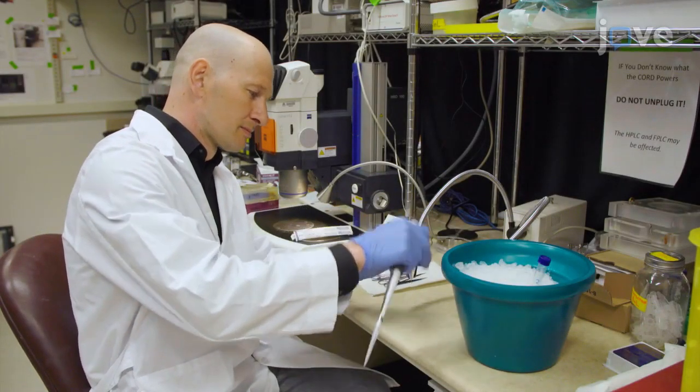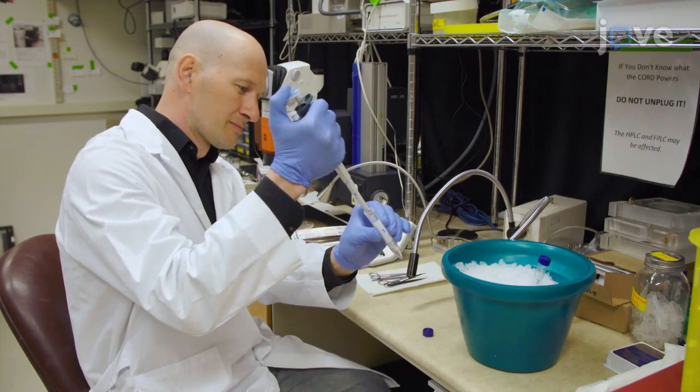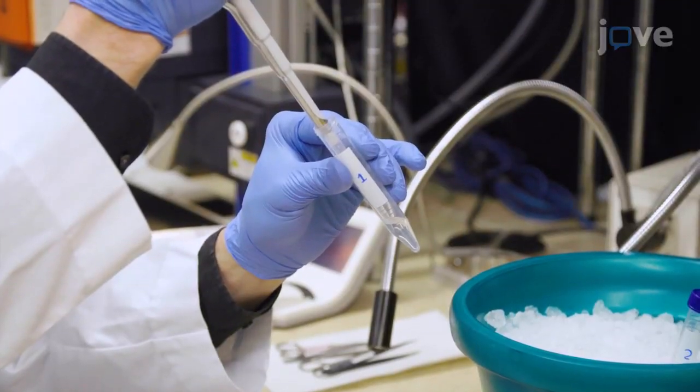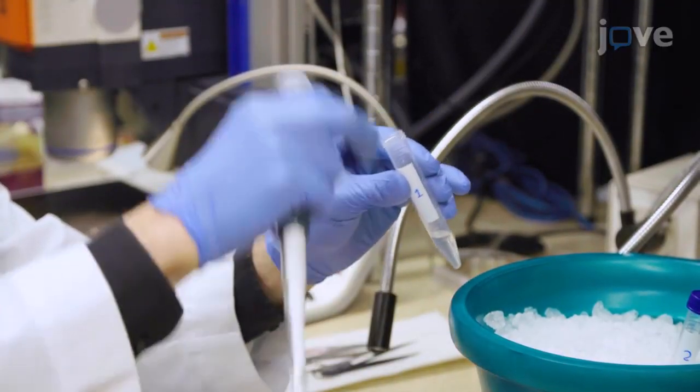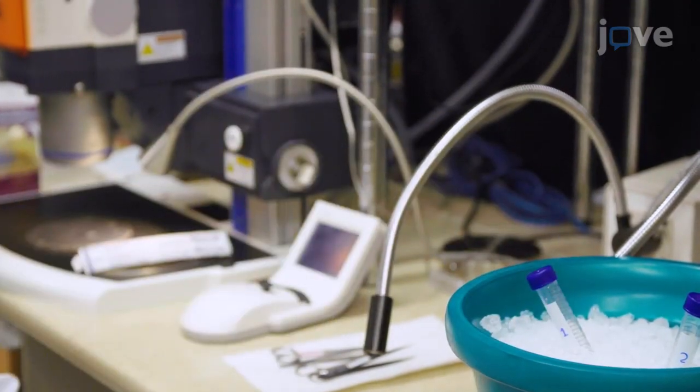For IV injection, concentrate cells to 0.5 to 1 million cells per milliliter using ice-cold 1XPBS to dilute or re-suspend the cells. Expect that approximately 1 milliliter of cell suspension will be needed for every 10 embryos.